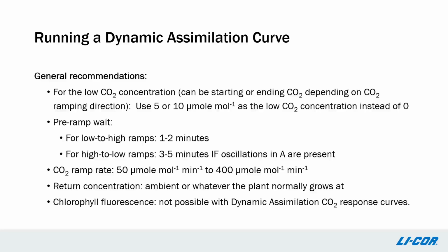Finally, please note that PAM-based chlorophyll fluorescence measurement is not possible during dynamic assimilation CO2 response curves. If chlorophyll fluorescence measurements are required, you will need to use the traditional steady-state method, which can combine CO2 response curve and chlorophyll fluorescence measurements.